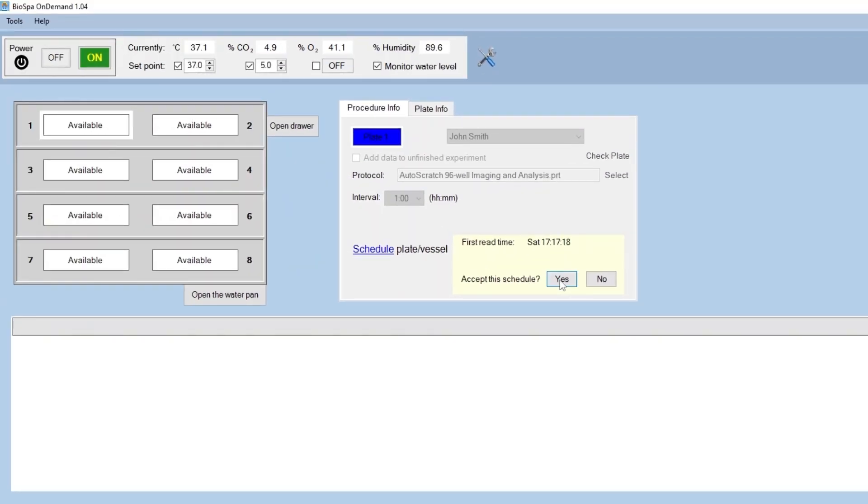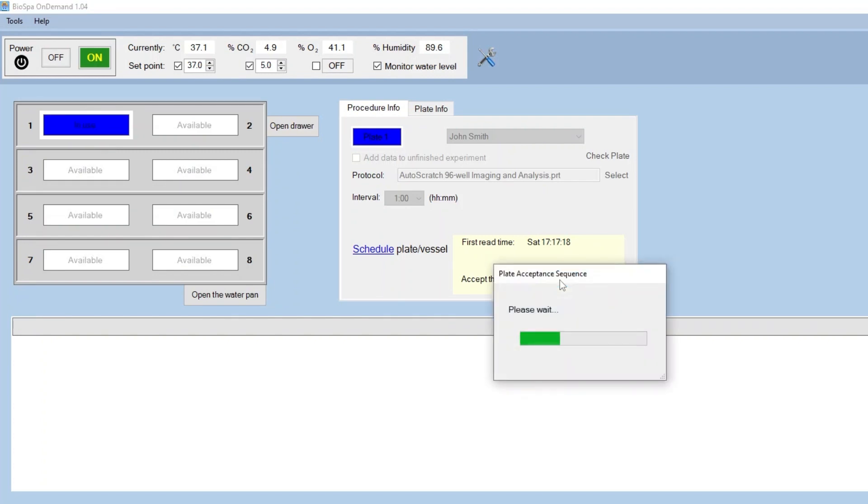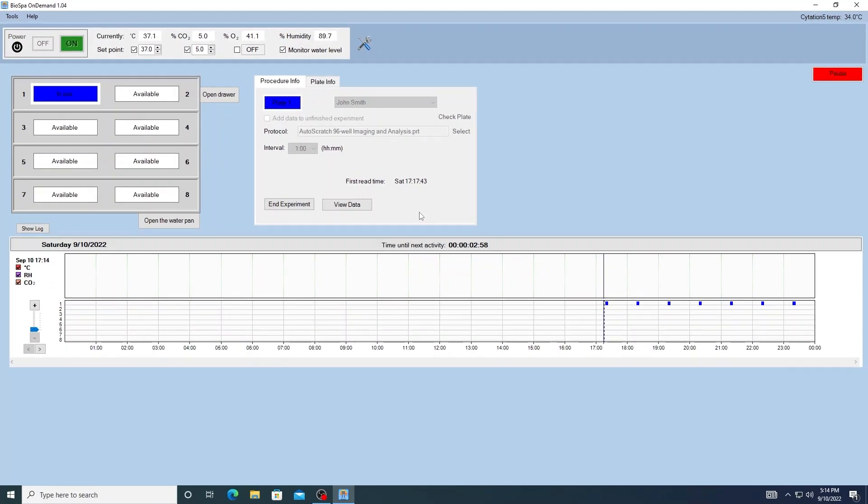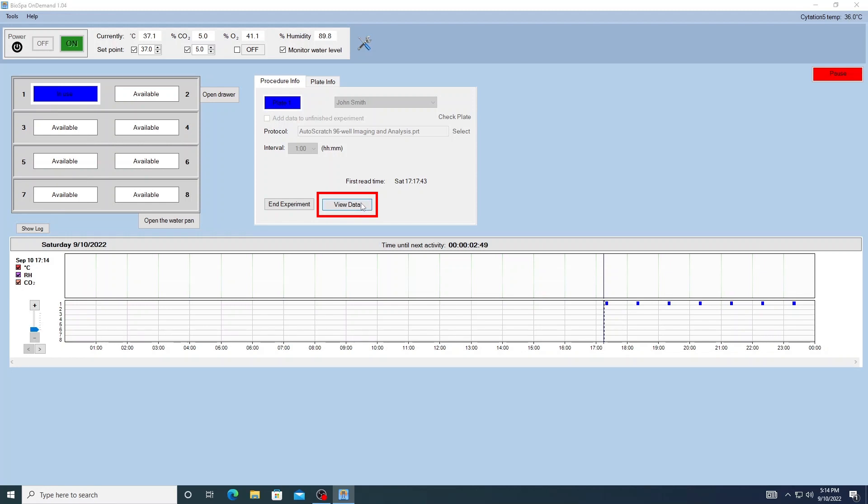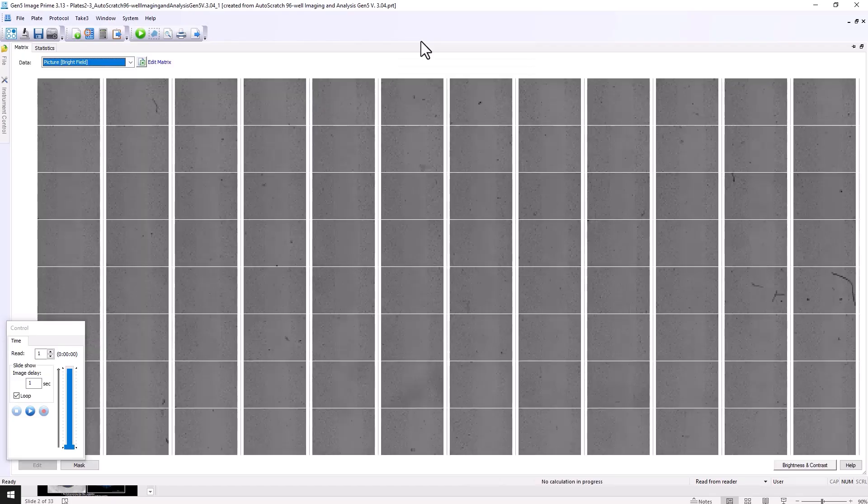Once a new protocol is begun, algorithms insert the new plate appropriately into the existing schedule to preserve the proper processing intervals for all vessels. During processing, users also have the ability to view captured images and analysis for each vessel and time point to monitor the status of the run.